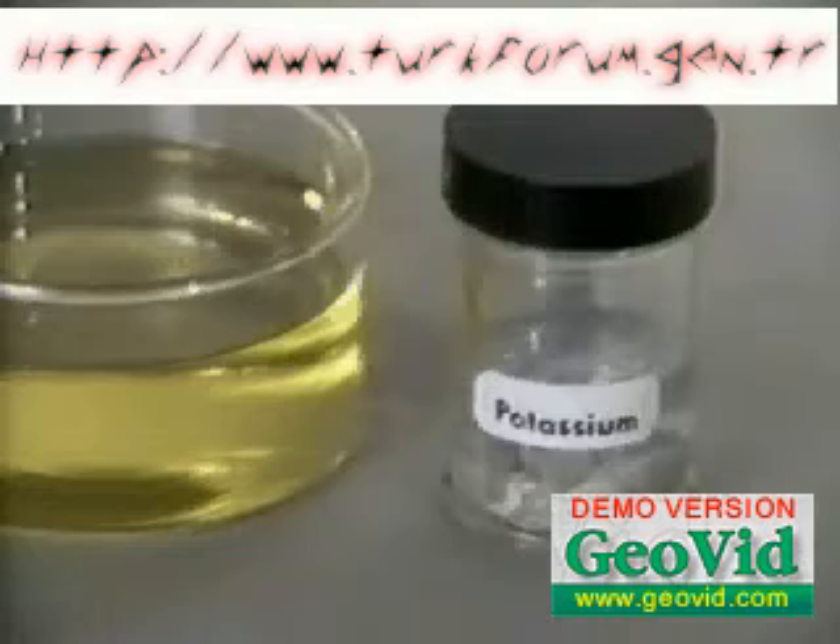Now potassium is added to the water. It reacts more vigorously. The hydrogen produced ignites immediately, and we see the lilac potassium flame. The bromothymol blue indicator again turns blue.